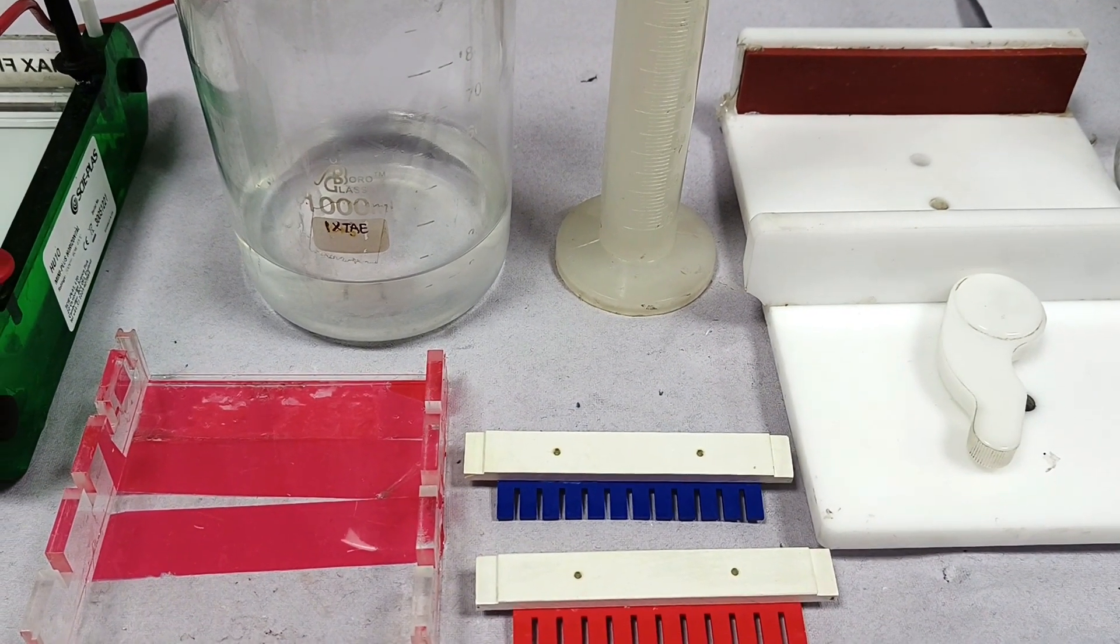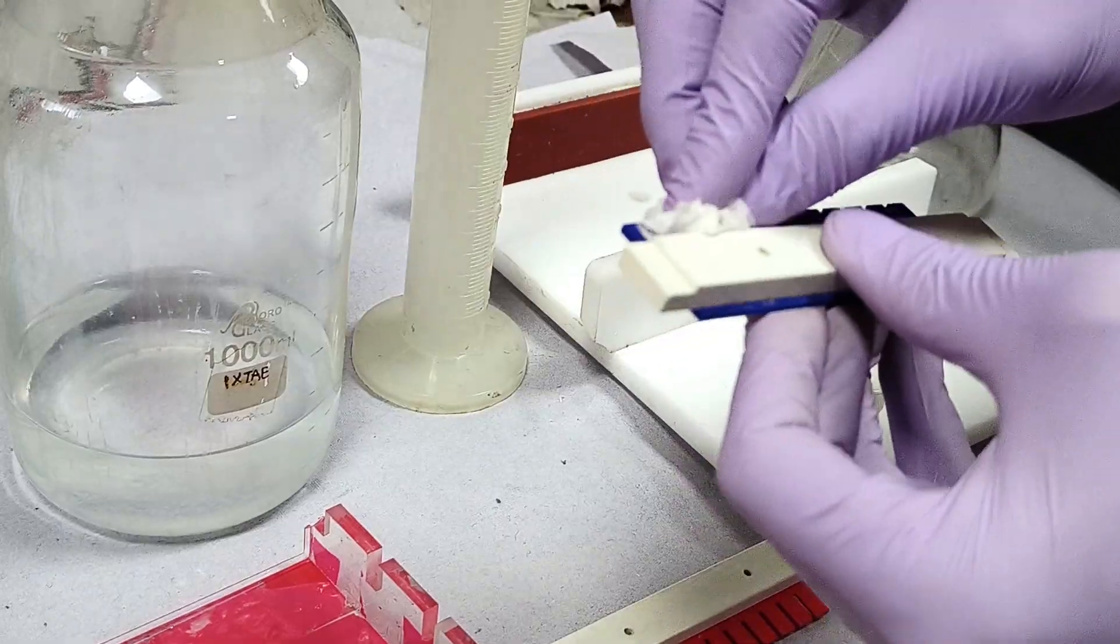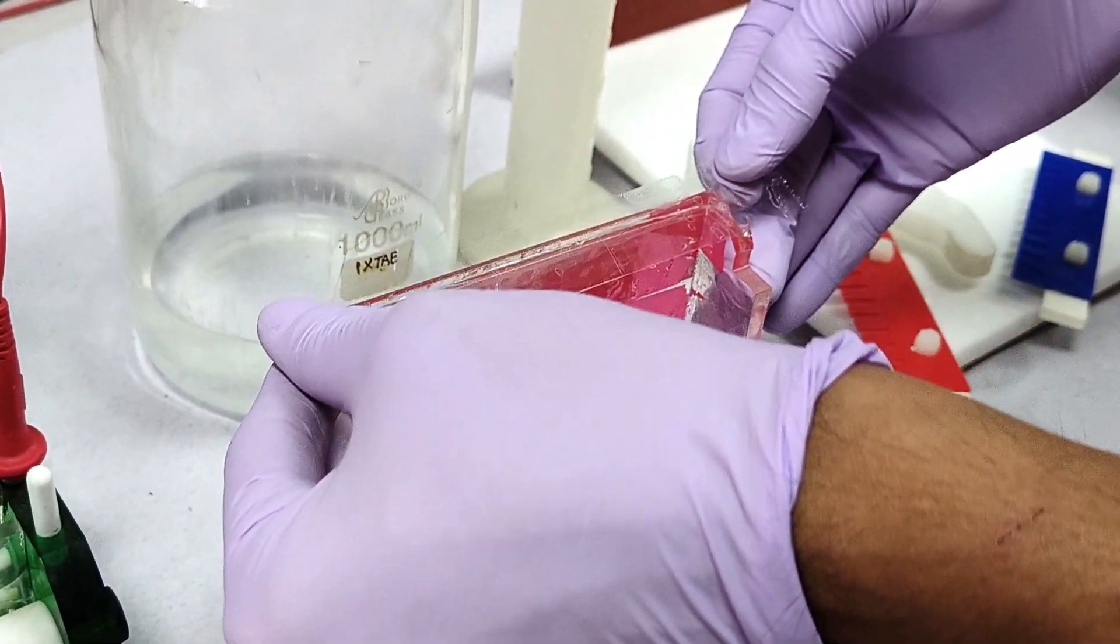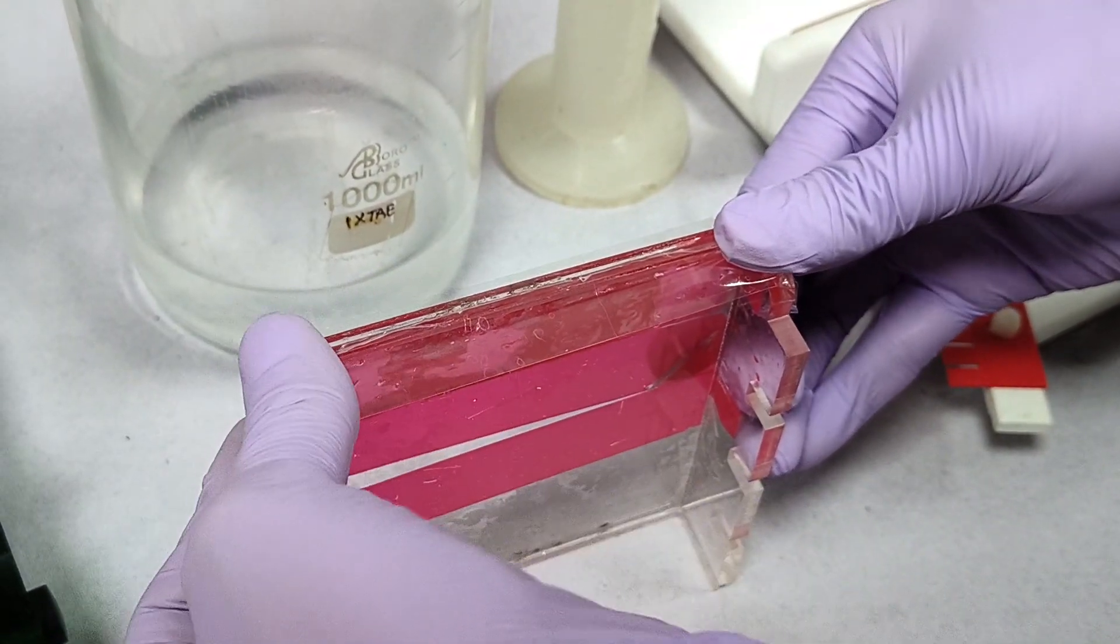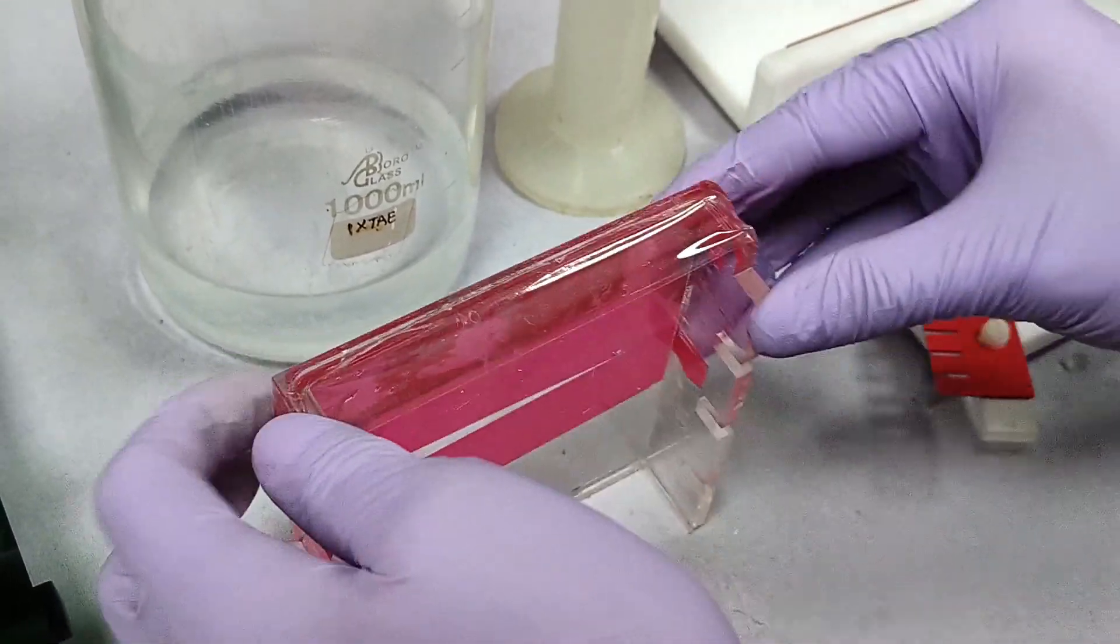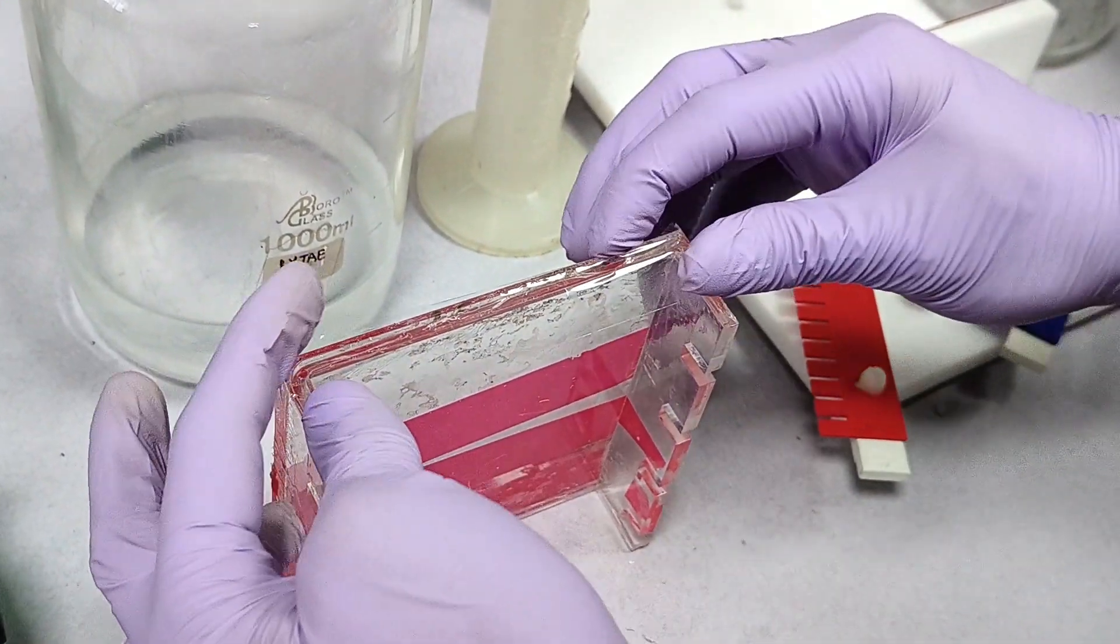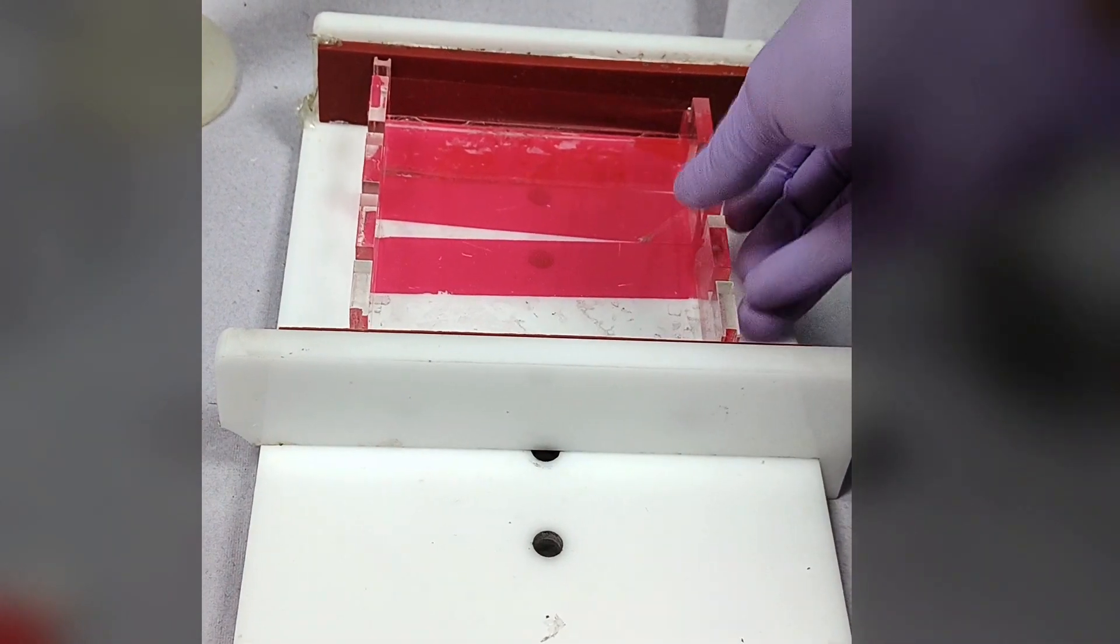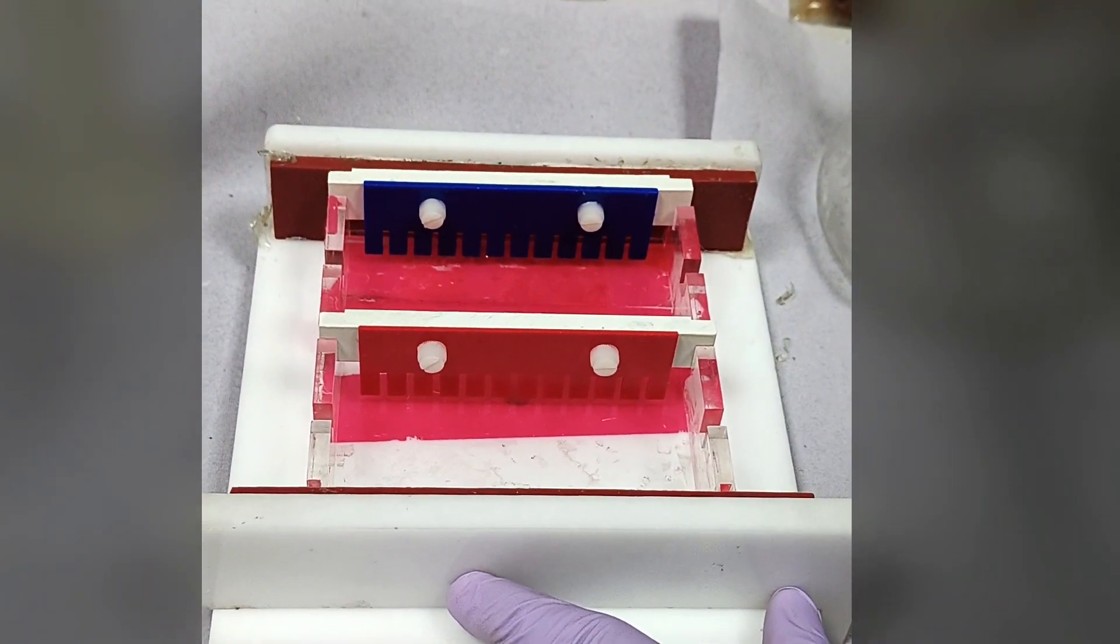This is the setup for casting a gel. First, properly clean the casting tray and combs with 70% ethanol. After cleaning them, sellotape is used to seal both the sides of the casting tray to avoid any leakage of the gel. Then the casting tray is placed on the caster, and the combs are properly kept in their respective slots. Depending on the number of samples to be analyzed, multiple combs can also be used.